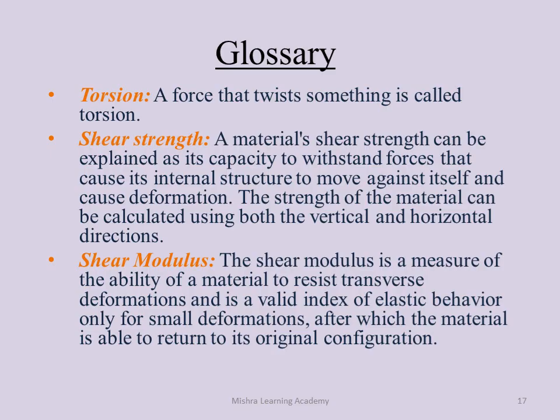Then what is shear modulus? The shear modulus is a measure of the ability of a material to resist transverse deformations and is a valid index of elastic behavior only for small deformations, after which the material is able to return to its original configuration.